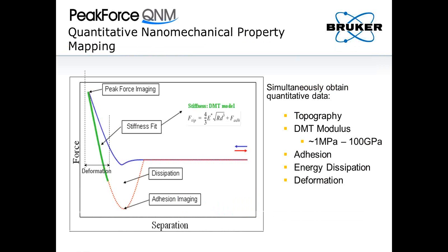The other benefit or advantage of PeakForce tapping mode is at each point a complete force distance curve is obtained. And from this force distance curve, you can learn quite a lot about the sample.